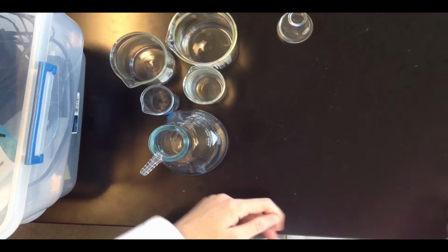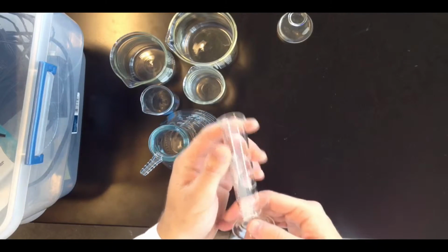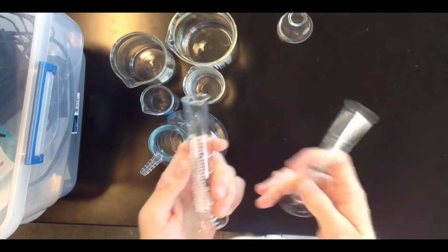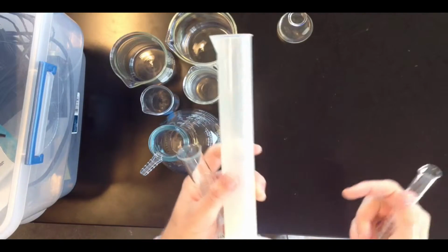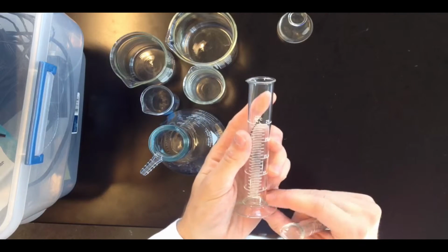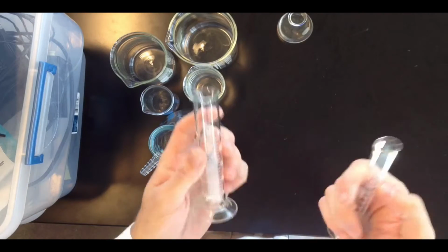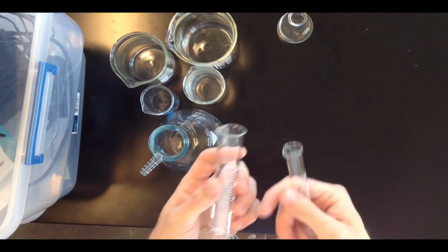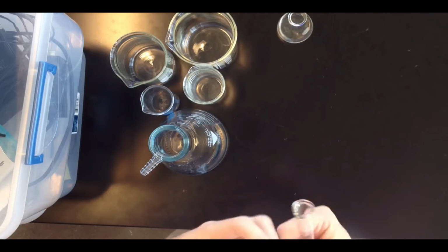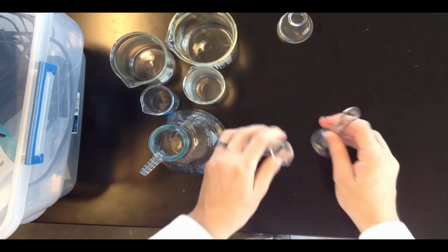Now thus far we haven't really seen any glassware that's used for delivering liquids. That's where the graduated cylinder comes in. So you'll have three different sizes of graduated cylinder, a 10 milliliter, a 25 milliliter, and a 100 milliliter. And these pieces of glassware are actually used to measure liquids. So you'll notice relatively fine markings on these that can be read to, in some cases, 1/10 of a milliliter for actually measuring out a prescribed volume of liquid. And we'll use these also almost every day to prepare solutions and other reagents for reactions and that kind of thing.